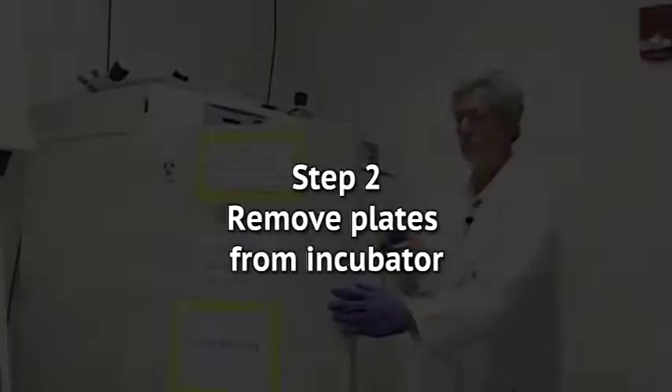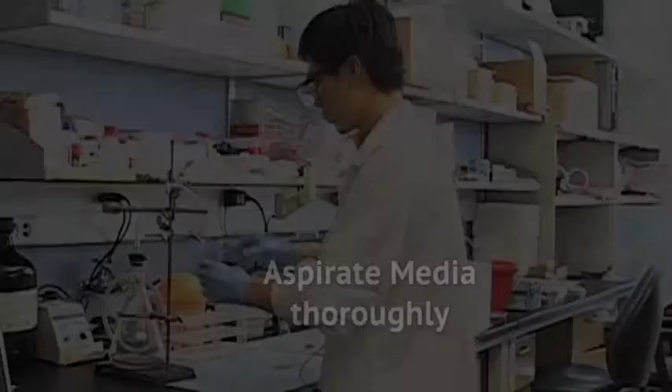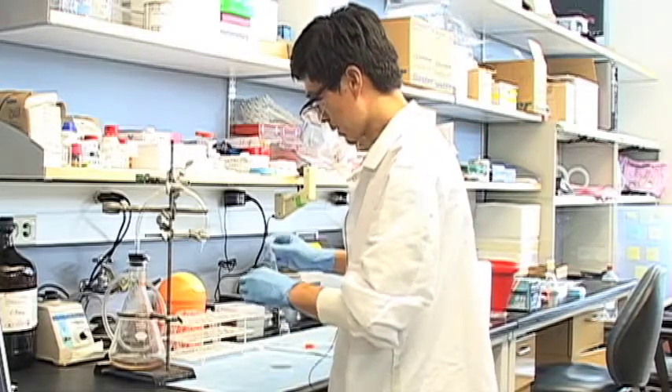Step 2: Remove plates from incubator. Thoroughly aspirate media from each plate. Steps three through five must be completed rapidly so the cells are exposed to the rinse buffer for no more than five seconds.